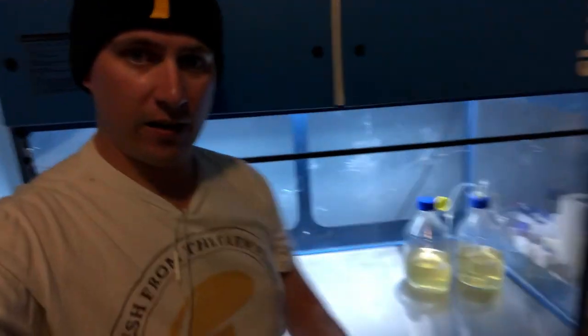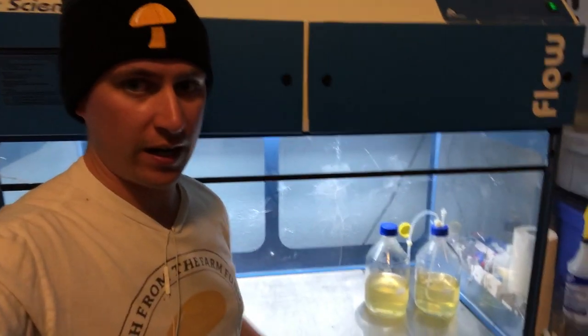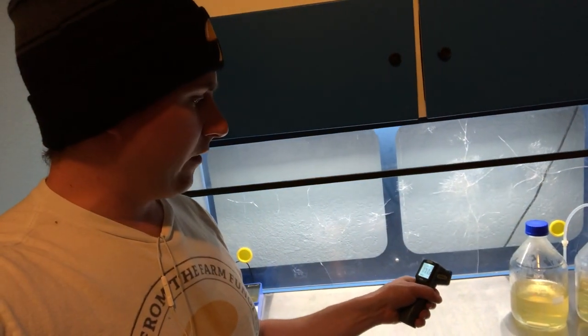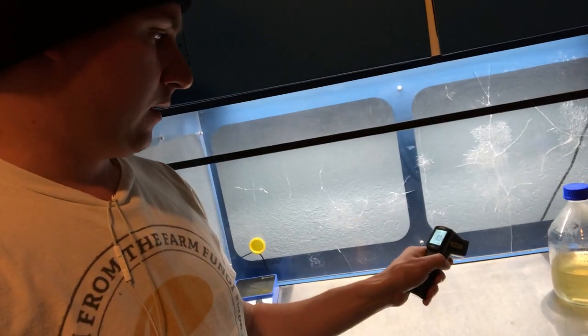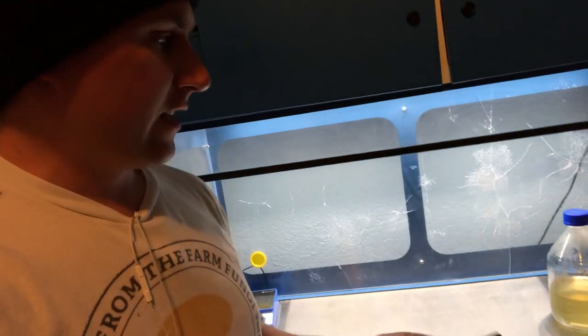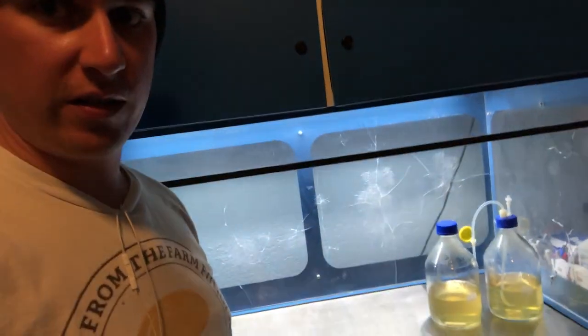So we've got our liquid culture sterilized and they're just cooling off right now. You want to make sure that those get down to room temp before you add any kind of mycelium, and right now they're at 174, 175. So that's a little too warm. I'm probably going to wait till tomorrow and inoculate these liquid cultures.